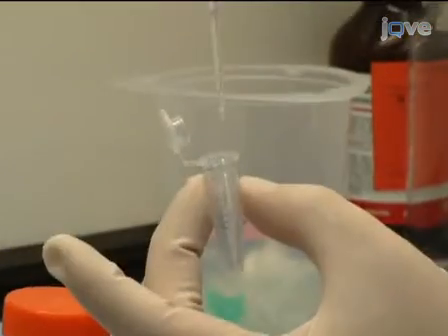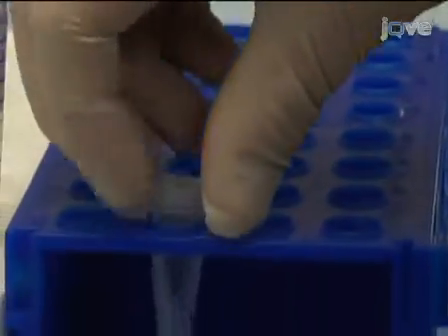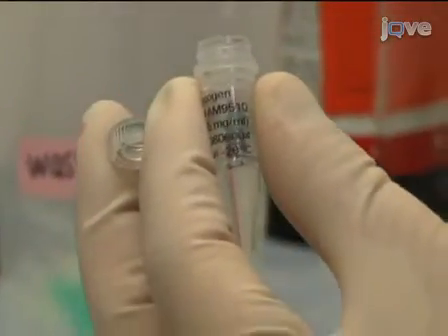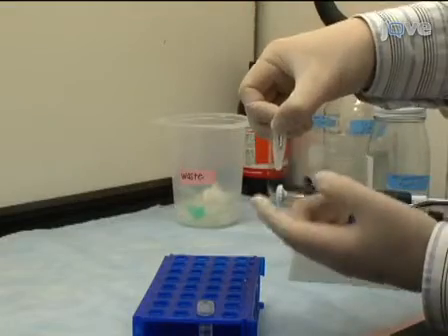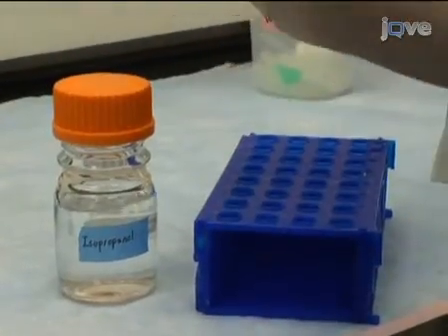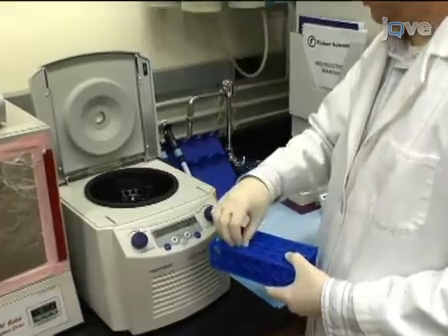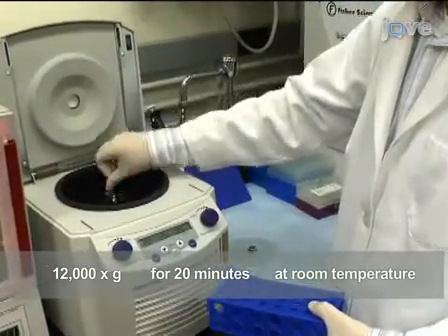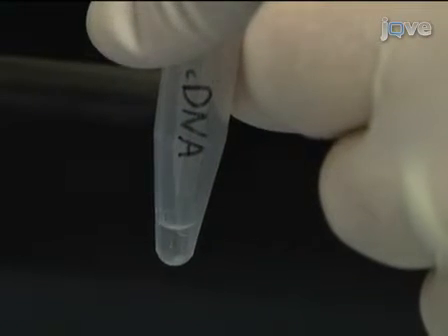To precipitate the cDNA, add 2 microliters of 3 molar sodium acetate at pH 5.2 and mix gently. Add 7 microliters of 5 milligrams per milliliter of glycogen and mix gently. Then add 30 microliters of isopropanol and mix gently. Allow the sample to incubate at room temperature for 10 minutes. Then centrifuge at 12,000 g for 20 minutes at room temperature. After centrifugation, a small cDNA pellet appears on the bottom of the tube; carefully remove the supernatant with a pipette.